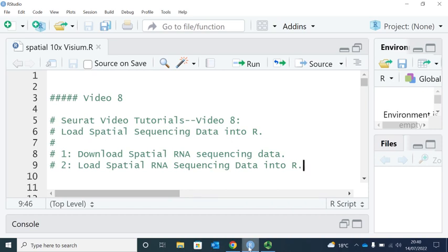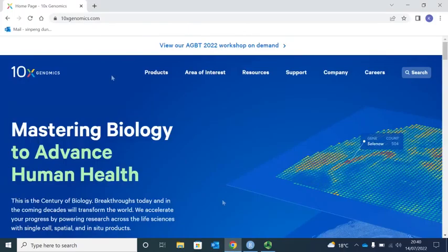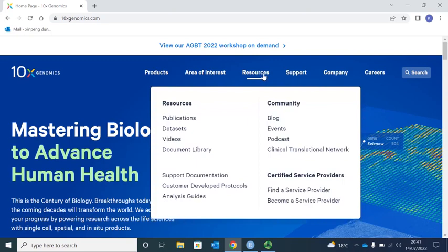First, let's download the dataset from the 10x Genomics website. You do need to register in order to download the dataset from the 10x Genomics website. On the website, we can find the publicly available dataset from the Resources link and then Dataset.